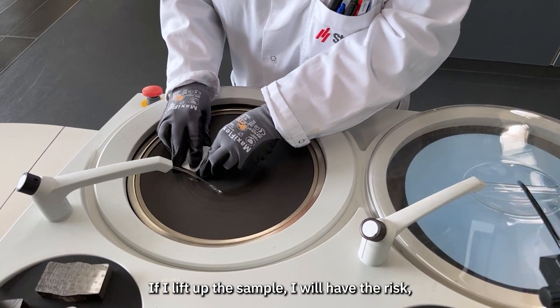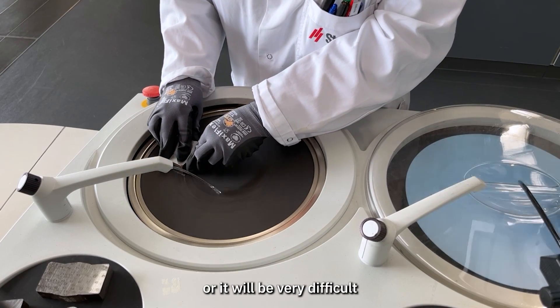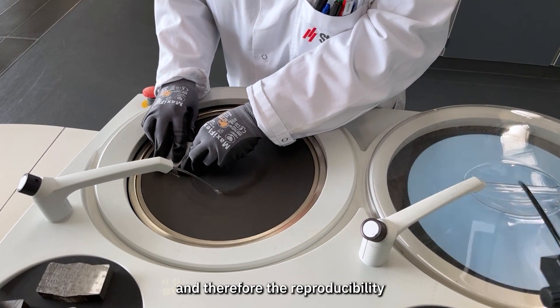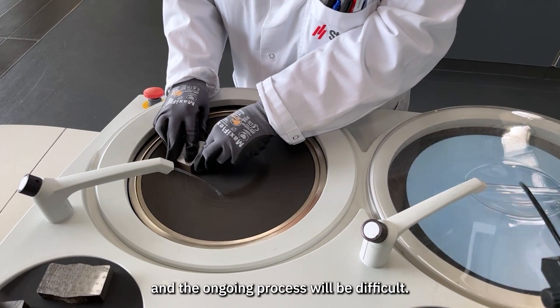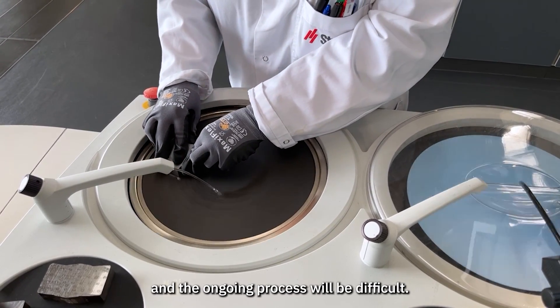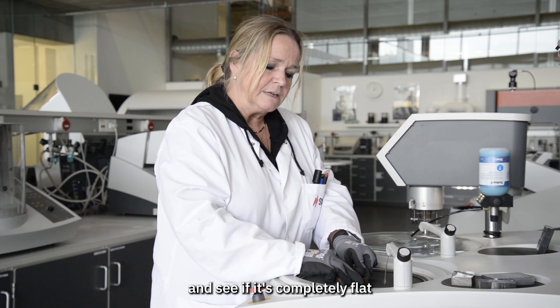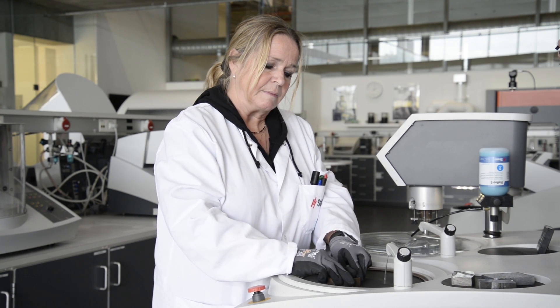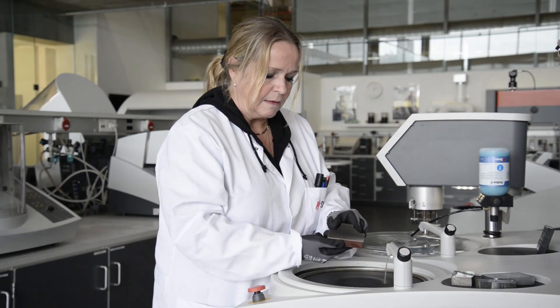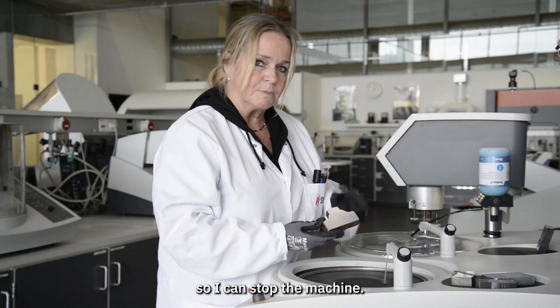If I lift up the sample, I risk it being very difficult to place it back down in the same position, and therefore reproducibility and the ongoing process will be difficult. I will lift it up, look at it, and see if it's completely flat on the whole surface — and it is completely flat now, so I can stop the machine.